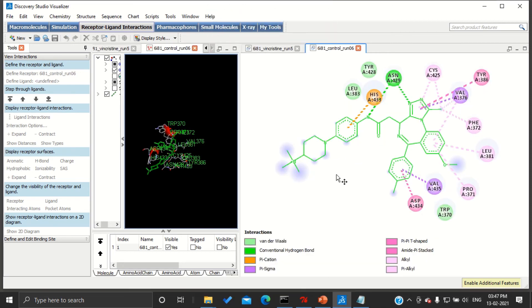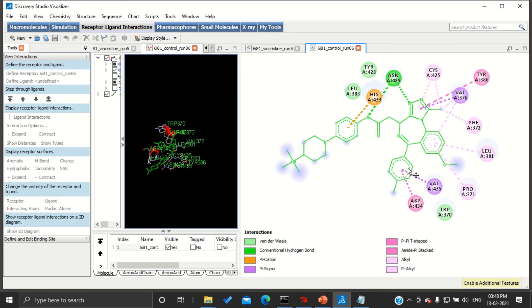Then you need to compare the energies, binding energy, or the interactions, number of interactions, and with which amino acid our ligand and control is binding. You need to compare both of them and then you can come to a conclusion.